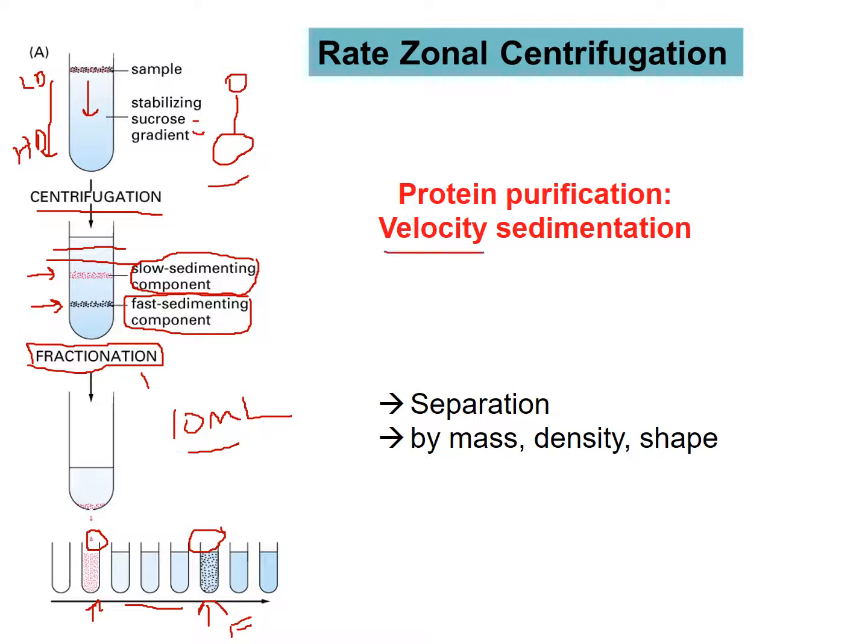This is also known as velocity sedimentation. Materials driven by the speed of the centrifugation will sediment where their density kind of leaves them. Now, time.